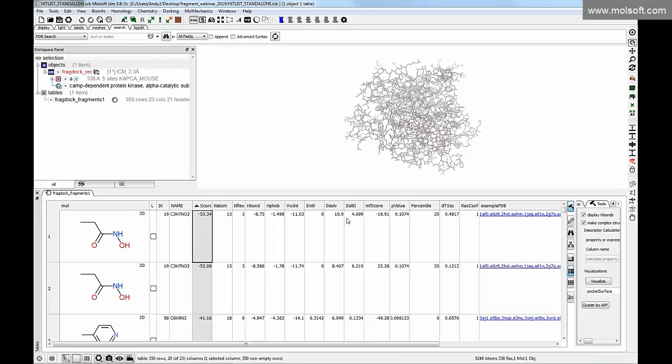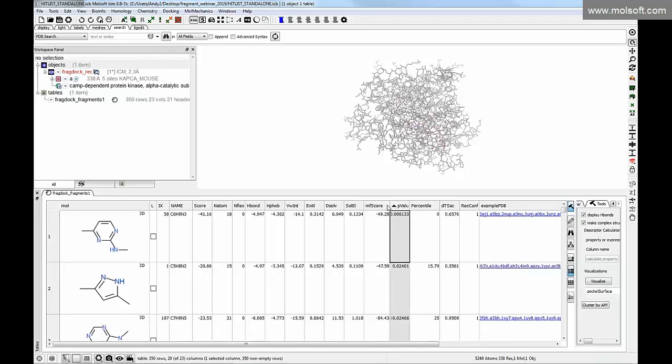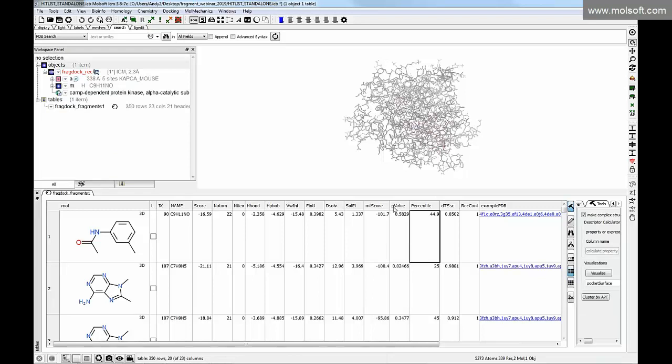But as I mentioned, we have some other predictive measures of confidence that a fragment is a true active, based on the PDB evaluations of the way that this fragment binds in the PDB. So we have the p-value. Generally for this data set, it's good to order it by p-value. You just click on the column here, and it will sort by p-value.